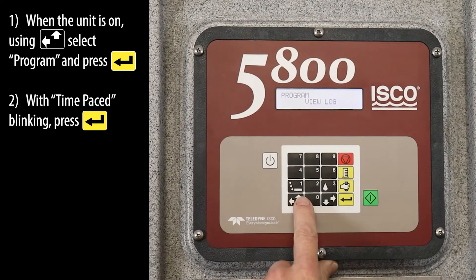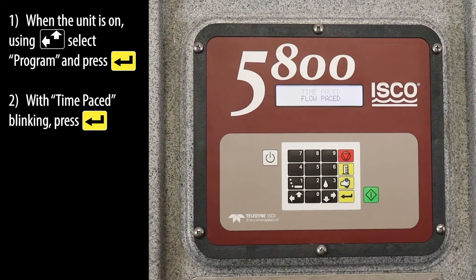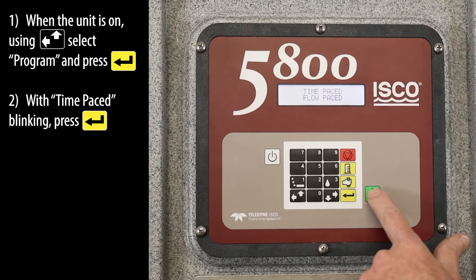When the unit is on, using the left up key, select program and press the enter key. With time paste blinking, press the enter key.